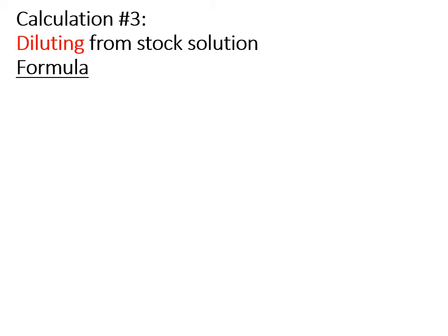Now, it's going to get a little bit scarier, but still very doable as long as you just follow the steps that we map out. Another big thing you end up having to do when you work in a lab is diluting from a stock solution, because a lot of times you're using the same reagents over and over in that lab. So it's cheaper and easier to just keep a very concentrated stock solution in the lab that each person can then make their own diluted bottle from.